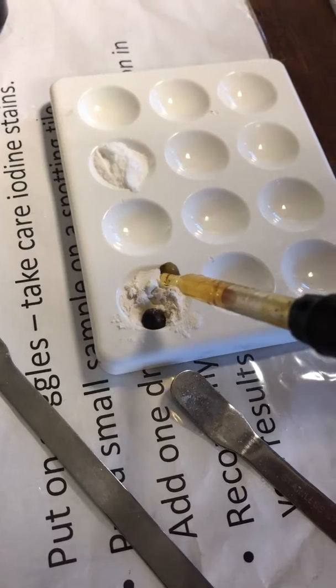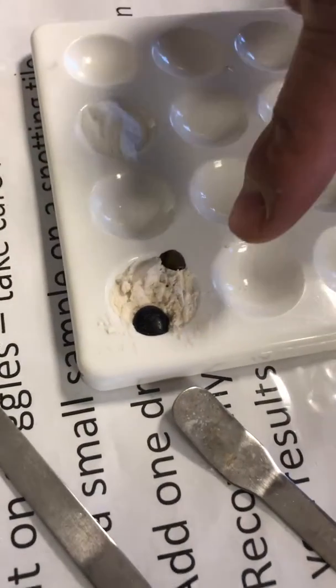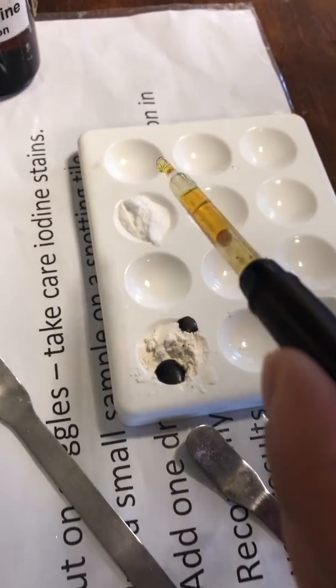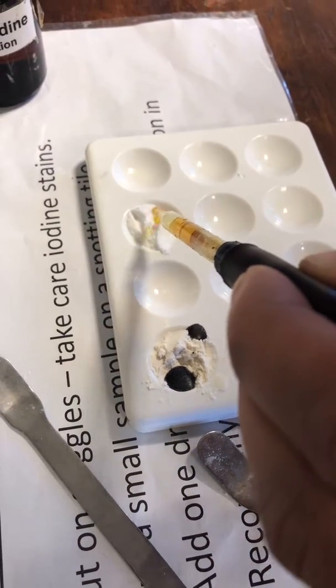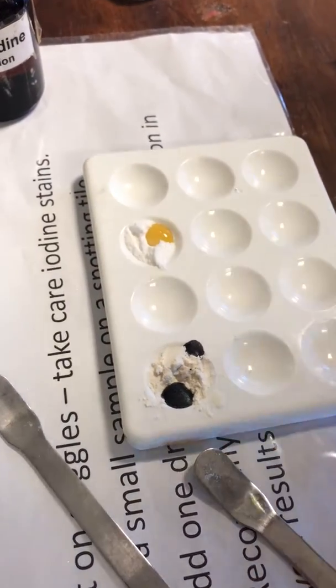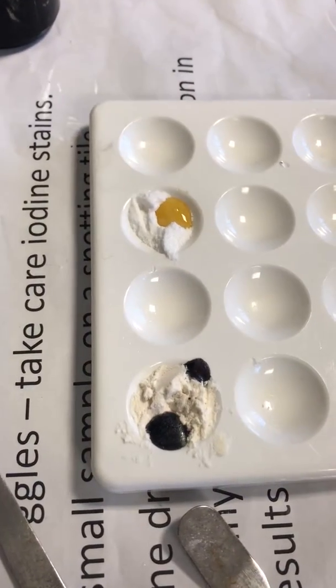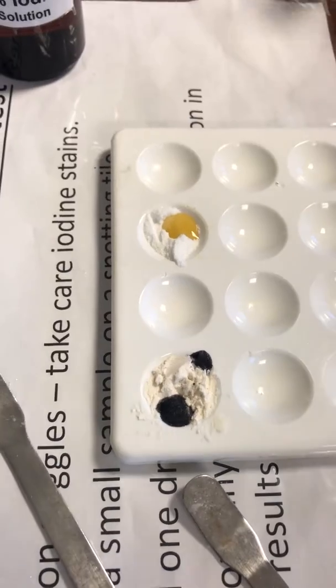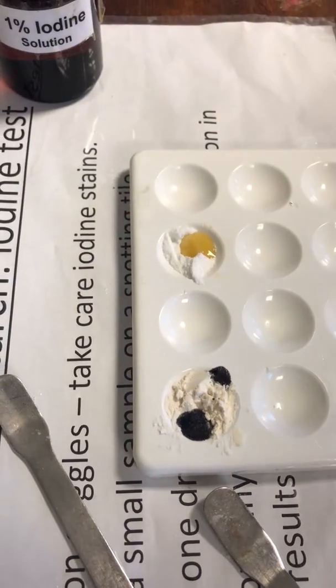So here we can see it's got a really, really dark black sort of colour, whereas with the glucose it doesn't change. So getting that dark black colour — really, really dark blue — is a positive result. If it doesn't change, then it's a negative result for starch.